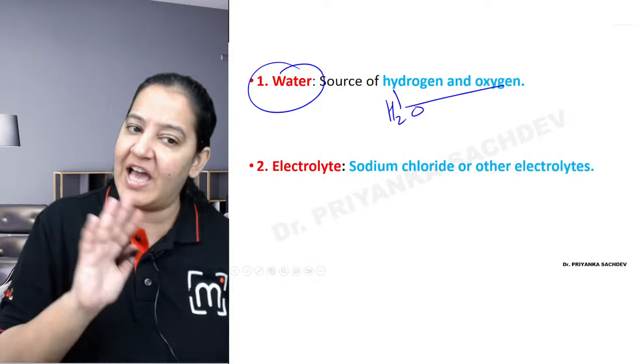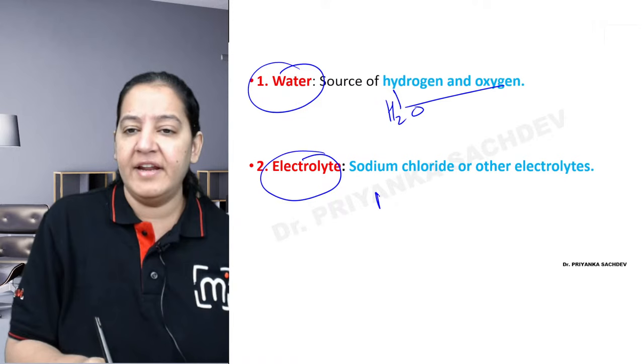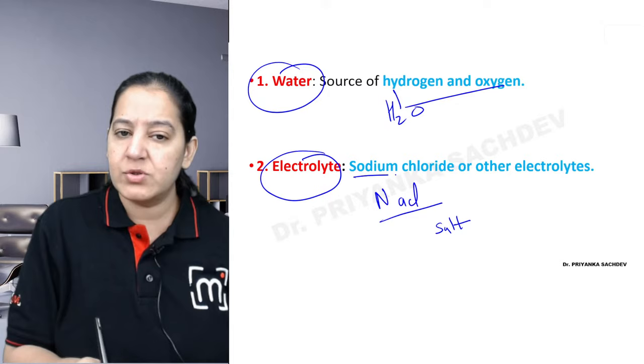All culture media contain water. The culture media contain electrolyte. In electrolyte, we provide NaCl, basically the salt. So sodium chloride we are providing with the help of the electrolyte, right?